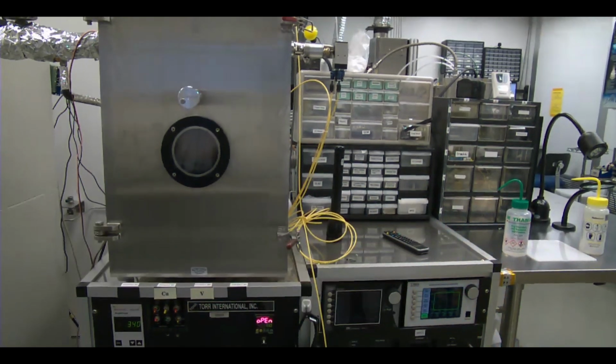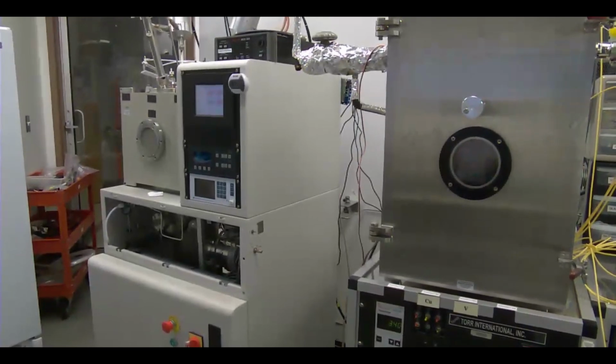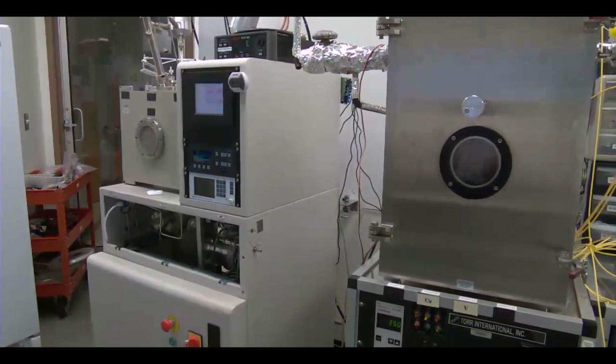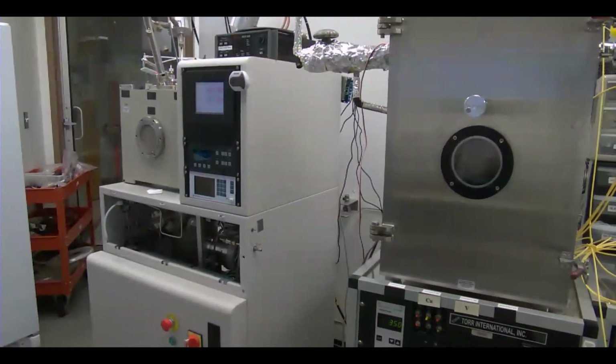But tungsten is very easy to deposit by the cold sputter deposition. You don't have to heat anything, and the sputter yield of tungsten is fairly reasonable. It's not unusually low. So we can sputter the tungsten. So which method you use for materials really depends on which is easier.